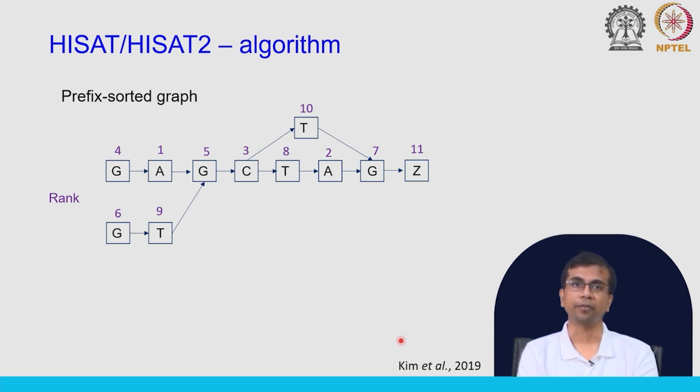Any substring that is originating from this A node, for example, AGCT, that is a substring. This will be the lexicographically first substring if we sort all of them. And it is actually very easy to generate this rank if you just simply look at the subsequent bases and then compare against the rest of the things. So, A is lexicographically first, so these A's will come first. So, you have 2 A's, 1 and 2, and among these it is easy to decide which one.